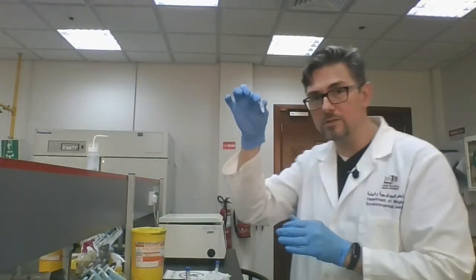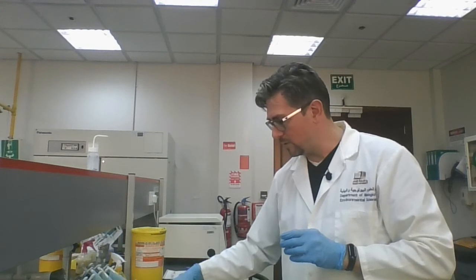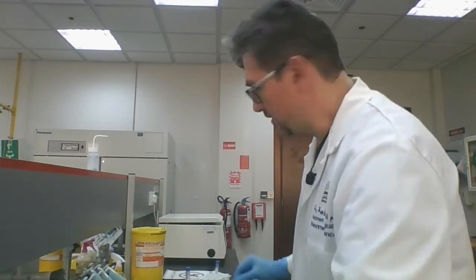So this can go into the phenol chloroform waste. That's going to be the organic waste beaker. And so I have one of my tubes ready to go. I'll do the same thing with the other one.